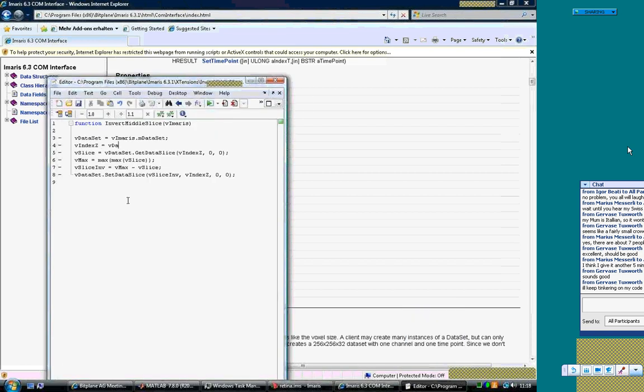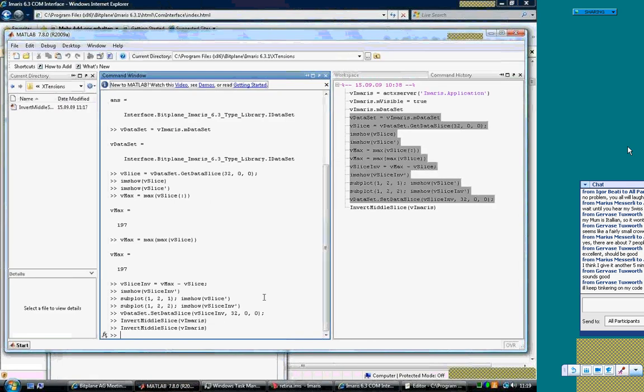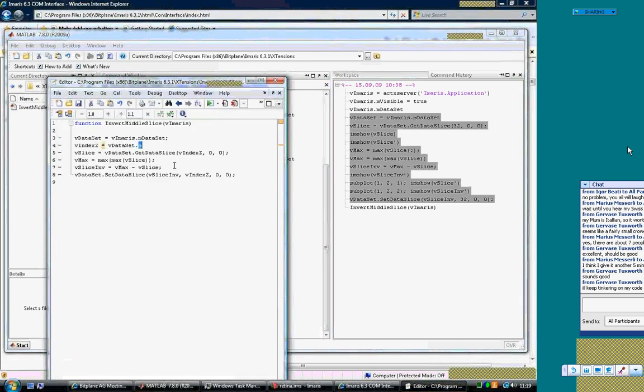Here we don't have autocompletion because of the tab. Oh, here we have it. Nice. But normally, when you don't have the value of this variable stored in the workspace, you can always go here, then use the autocompletion, copy and paste again in your editor. And now we divide by 2 to get the middle slice.